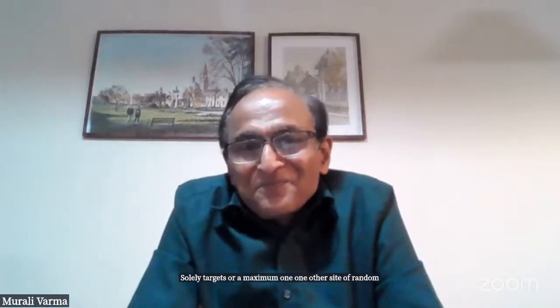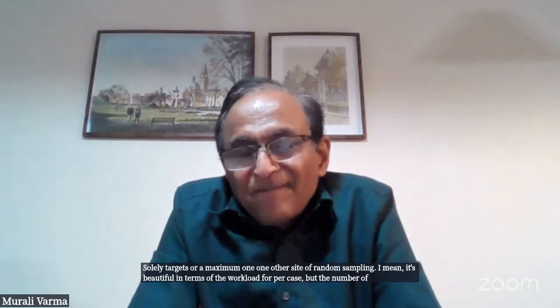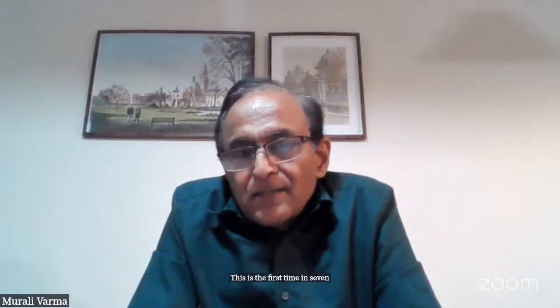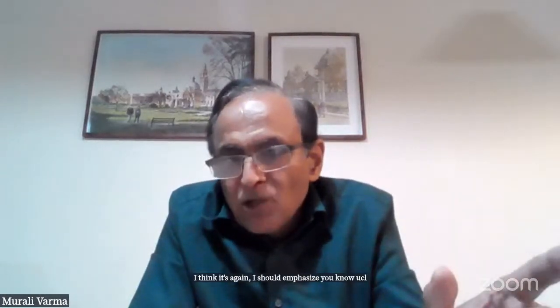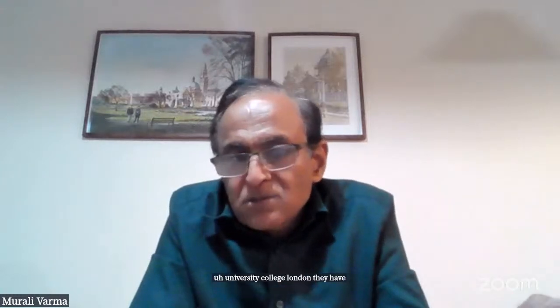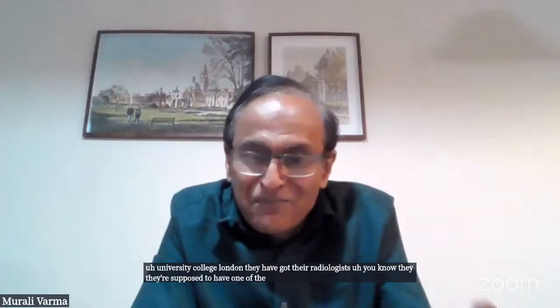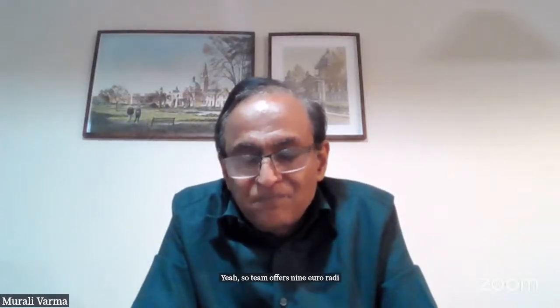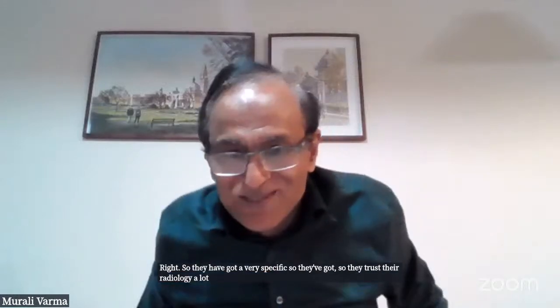I mean, it's beautiful in terms of the workload per case, but the number of cases I've told you is, this is the first time in 7 years we're fully staffed. So 600, 700 biopsies coming through is a lot of work. I think, again, I should emphasize, UCL, University College London, are at the forefront of prostate multiparametric MRI. They have 9 uroradiologists catering to just prostate cancer. So they've got a very specific setup, and they trust their radiology a lot more than many other centers would.